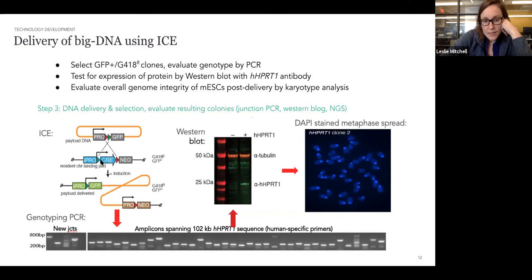heterotypic lox sites flanking this Cre recombinase that's inducibly expressed will lead to recombination, which will overwrite the Cre and introduce a GFP downstream of the inducible promoter and reconstitute the neomycin resistance gene, which is otherwise lacking a start codon. To the extent that one can look for colonies that become green and have resistance to neomycin or G418 on the plate, one can do this high-throughput genotyping.